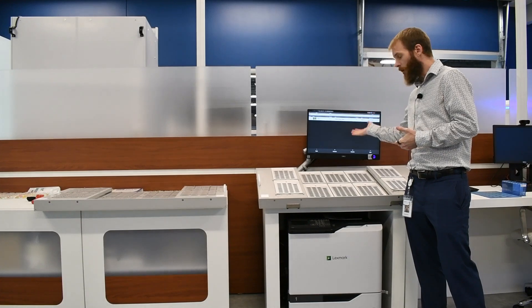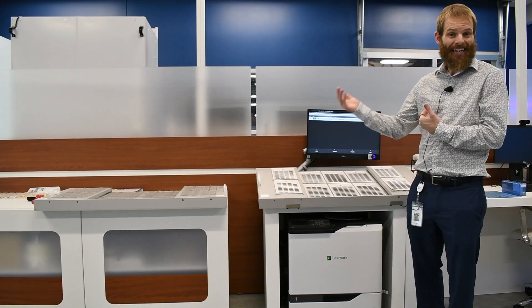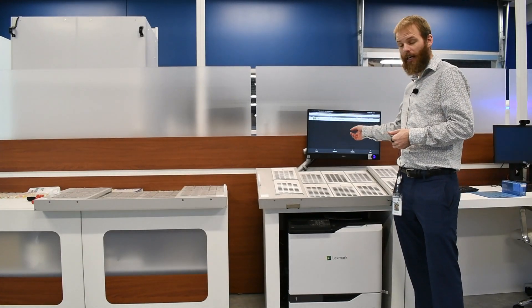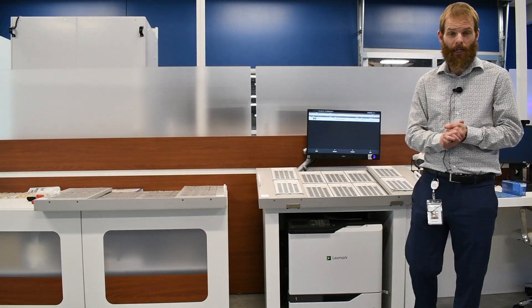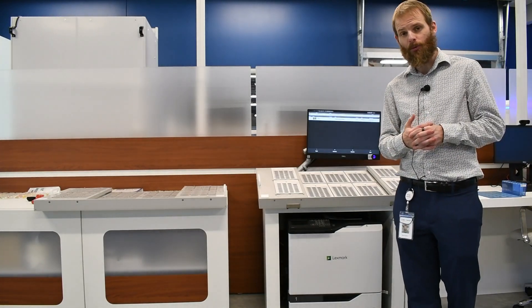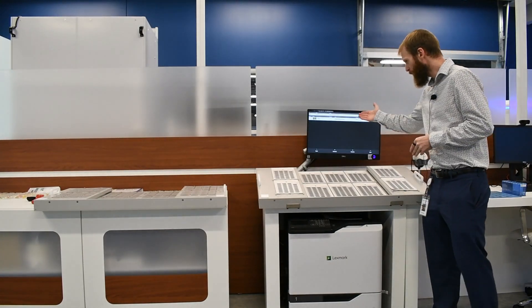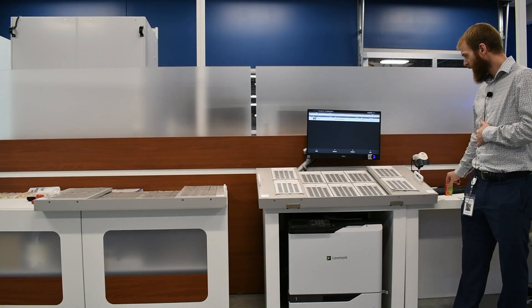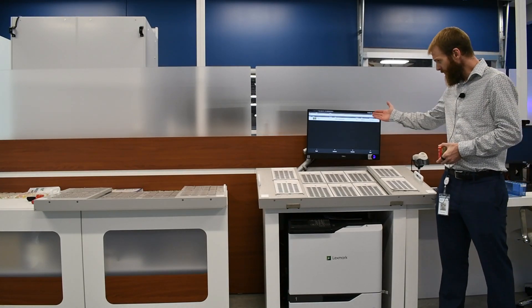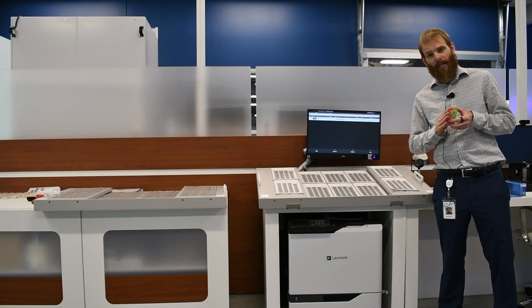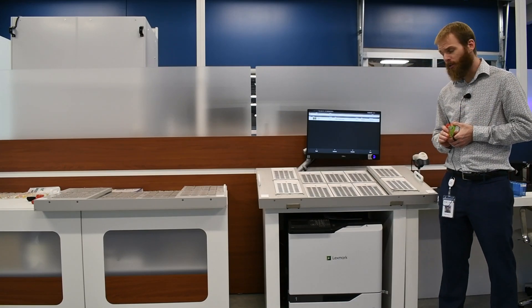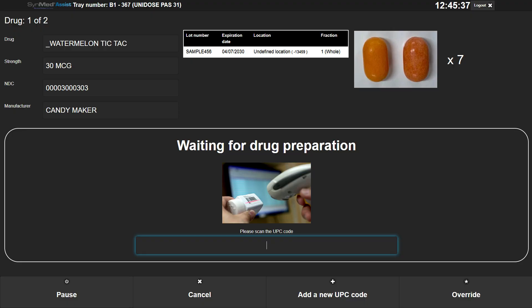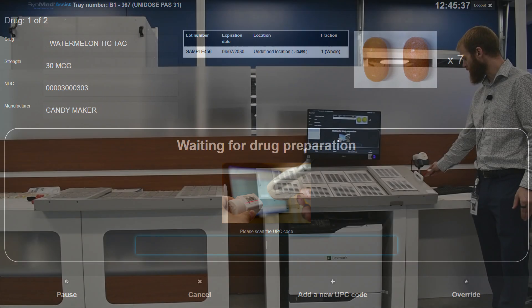Depending on your workflow, you can either get these drugs ahead of time when you're associating the job, or your technician can go get those drugs at this point. So you have some flexibility depending on when you want to accomplish certain tasks, but it will list all the drugs you need for the cards on the tray. After getting those stock bottles, the technician will select next.